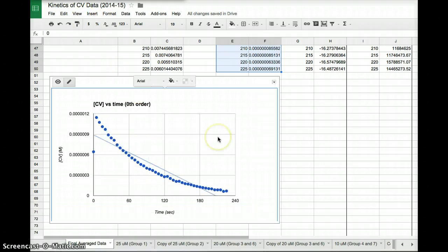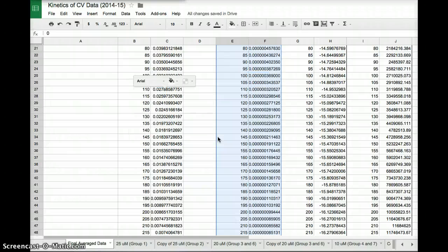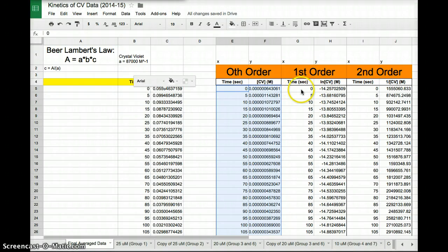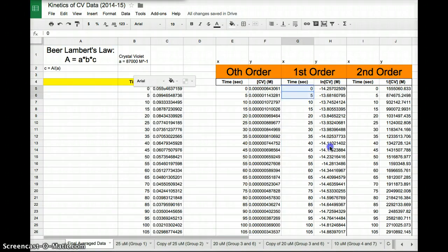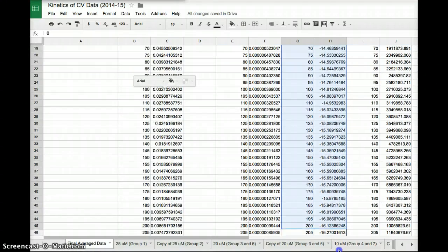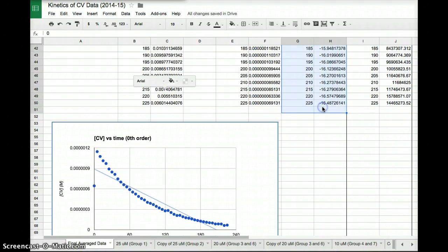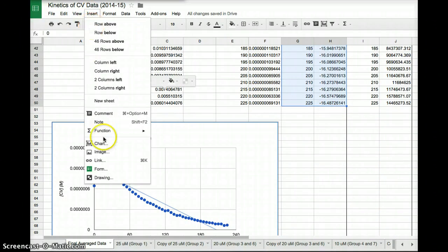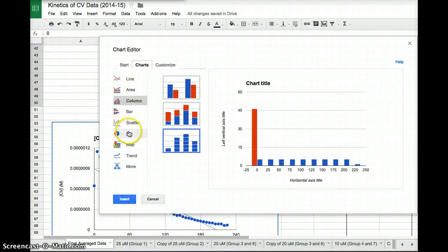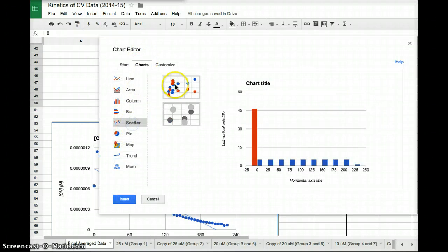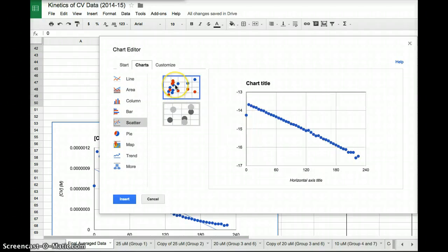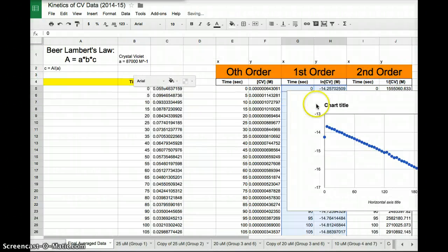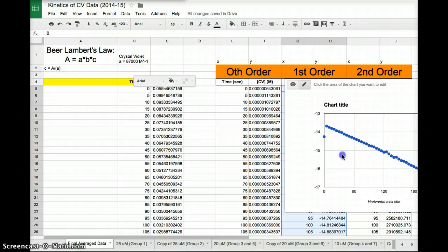Your next step is to create two more graphs for each of the other data sets that you have. So for first order, again, we'll go over here. We'll highlight all of our data. You'll go to insert, chart, charts, scatter, boom, insert. There's our data.